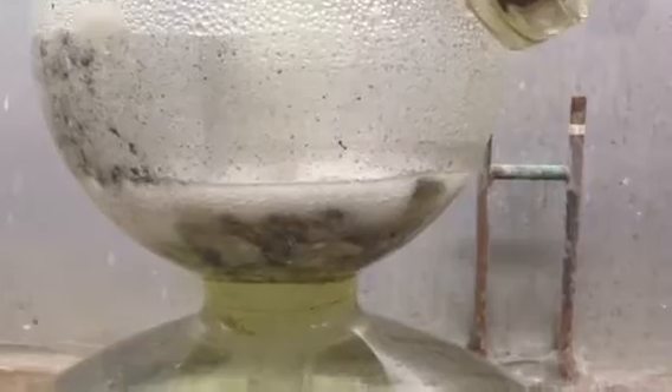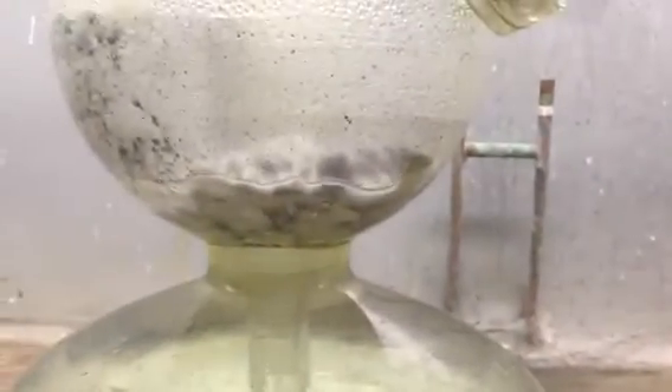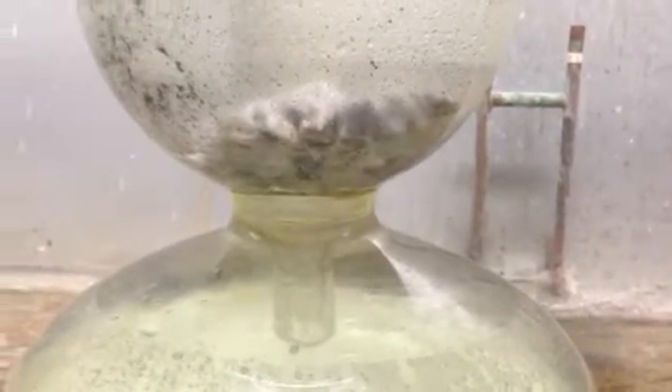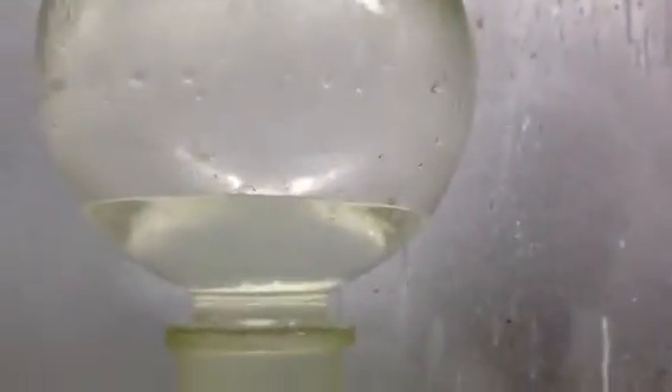The trouble is with a regular gas generator, once you start the reaction it's going to continue until it's finished. With this setup, all I have to do is close this valve — the pressure will build up and it pushes the acid away from your reactant, and the reaction stops. There's no more gas being produced and it reaches an equilibrium as the acid is pushed back up into the reservoir at the top.